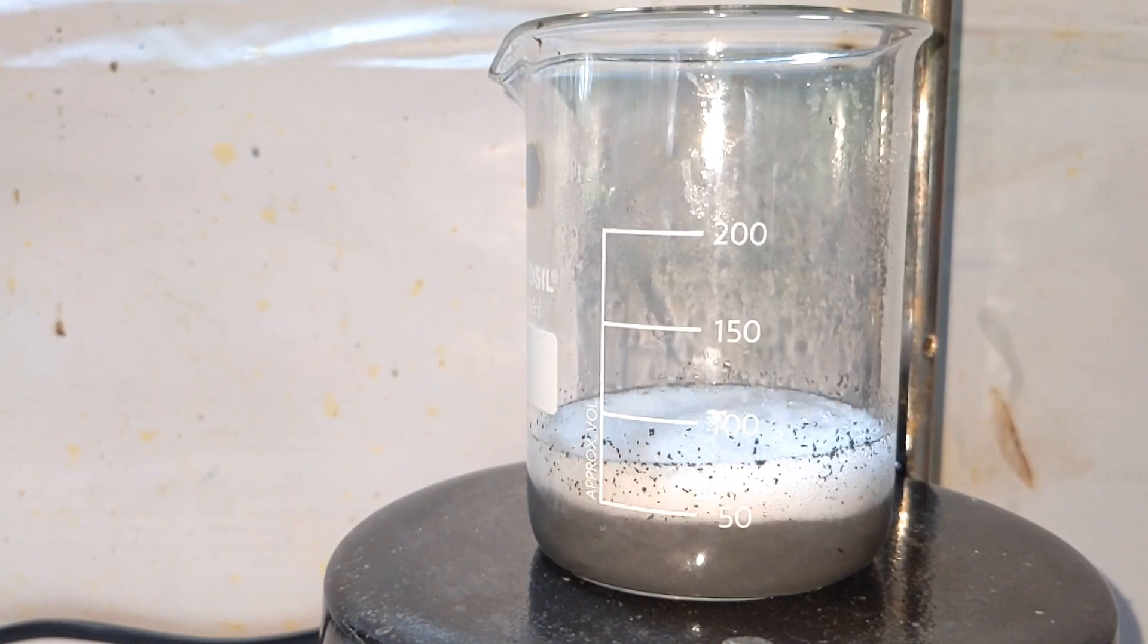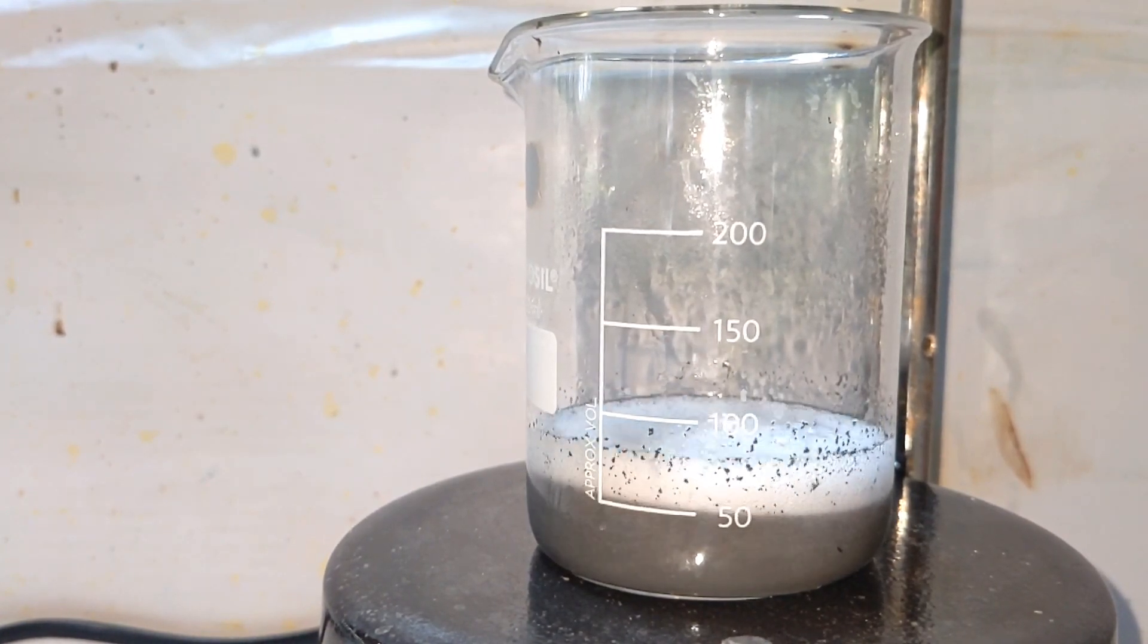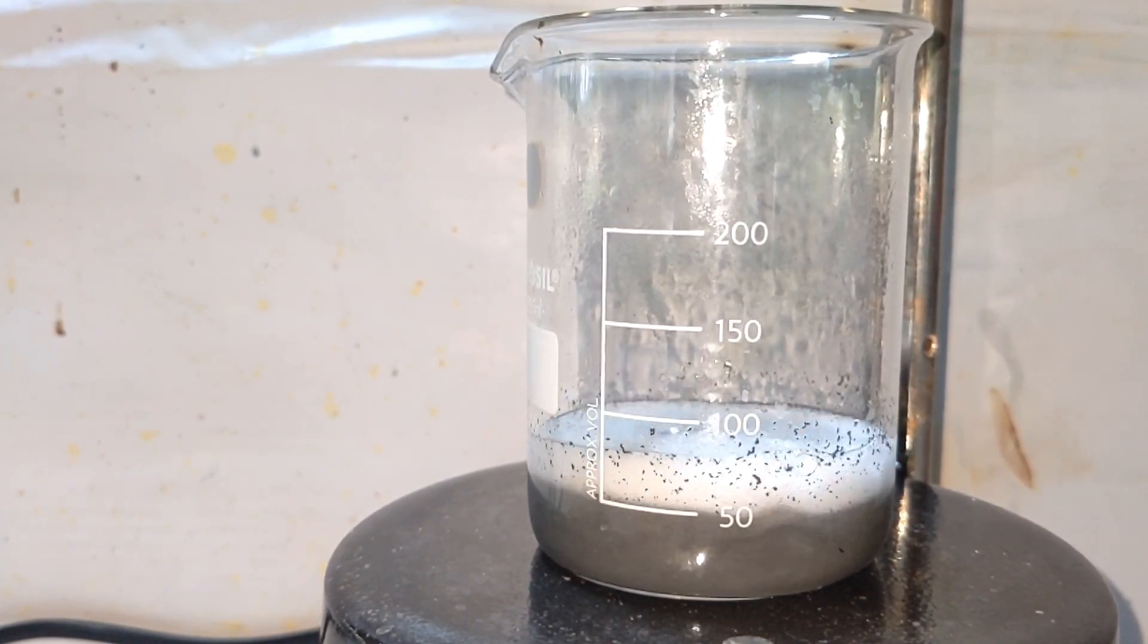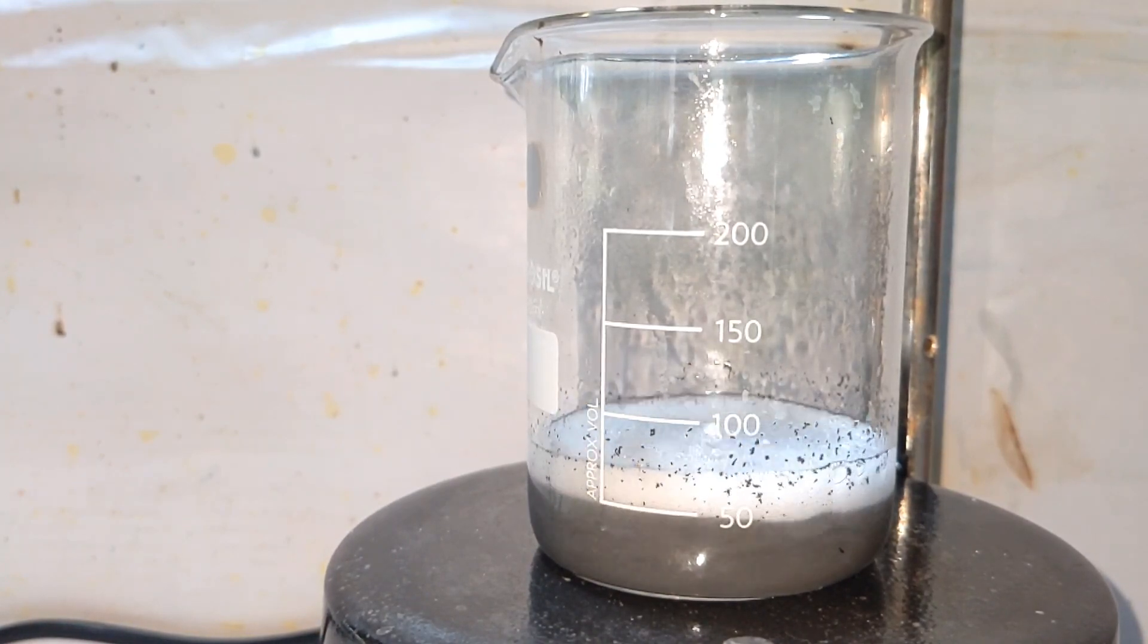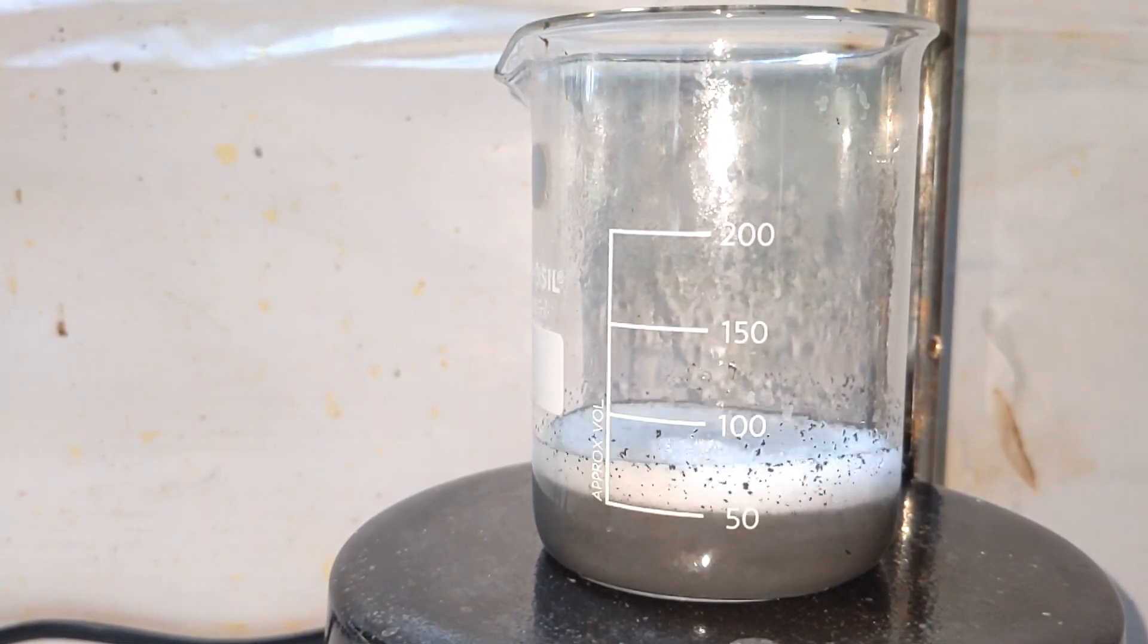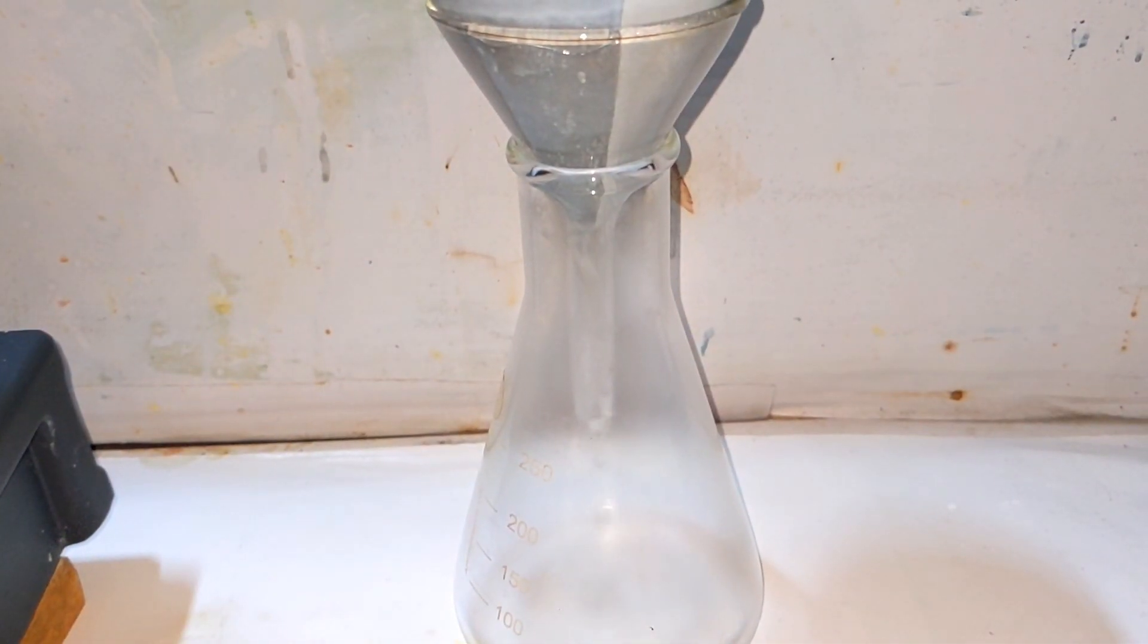You can see a lot of foaming going on and a dark precipitate is seen on top. All those are impurities that remain unreacted. We keep on adding hydrogen peroxide in small lots when you see the reaction dying down.